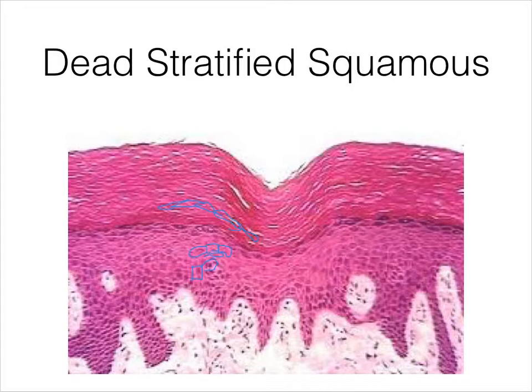This is not connective tissue. We're not looking at fibers here. The dead keratinized layer of your skin can look like some connective tissues, and we'll talk about those later, but you should learn to recognize them in the context that they're likely to appear in a body. So you would never see connective tissue that is facing a lumen or the outside world. You won't see it in association with these living cells underneath it. It won't look like it's on a piece of skin.